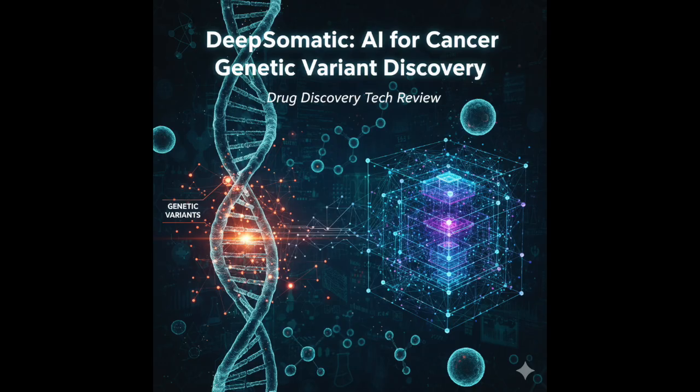So looking at their example output, chr1, 14,003, C, G, 43.8, PASS, VAF=1. Yep, that tells you: chromosome 1, position 14,003, reference is C, variant is G, quality score 43.8. Critically, filter is PASS, meaning DeepSomatic calls this a confident somatic variant. The additional info shows the VAF is 1, or 100% in this case, meaning all tumor reads showed the G. But you could also have a PASS variant with a much lower VAF, say 0.05. Absolutely. And that's the power.